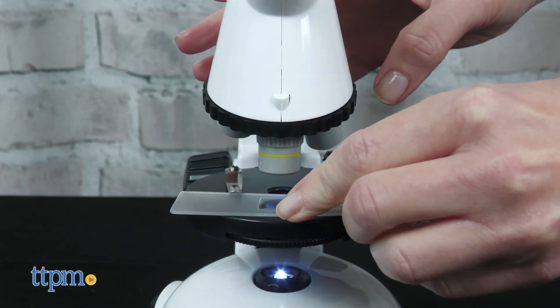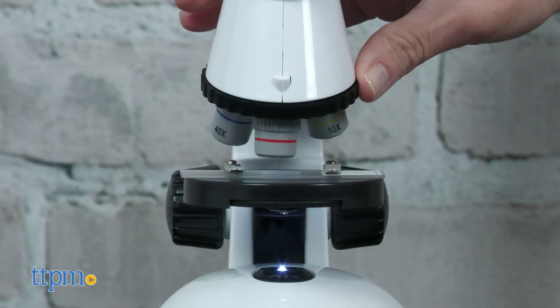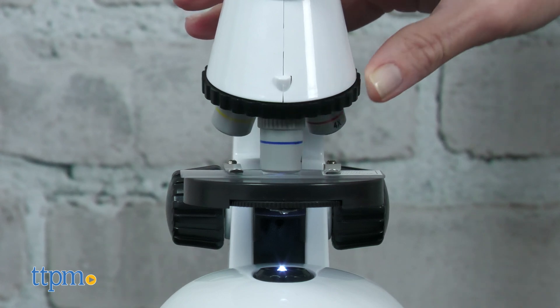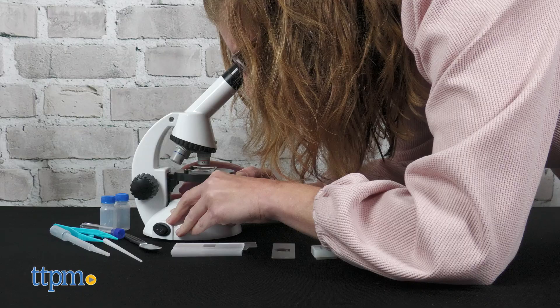Themes & Cosmos sent us this microscope to review, and it comes with three objective lenses for magnification powers of 60, 150, and 600. This 45-piece set comes with the tools kids ages 8 and up need to collect specimens and prepare slides.